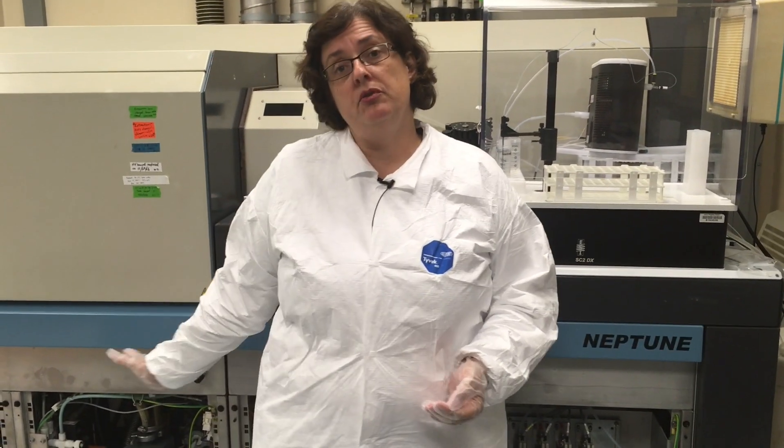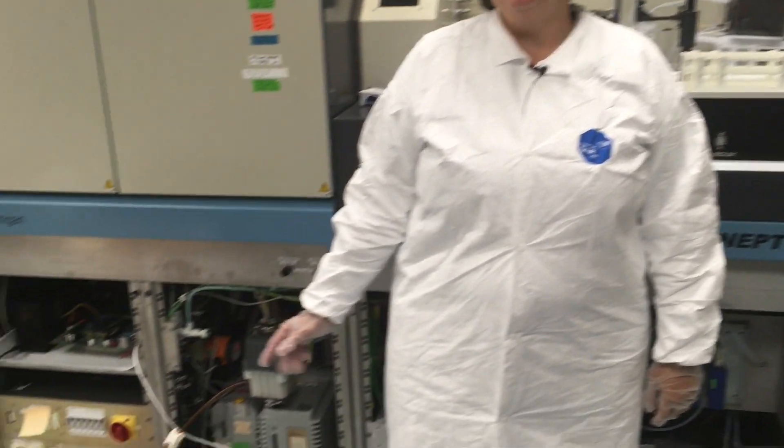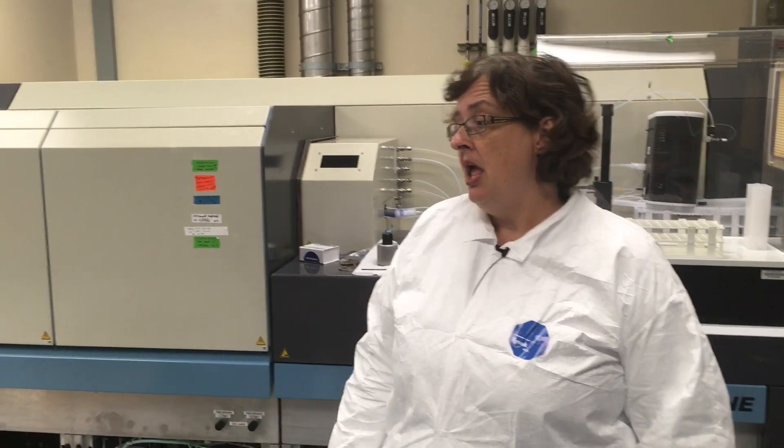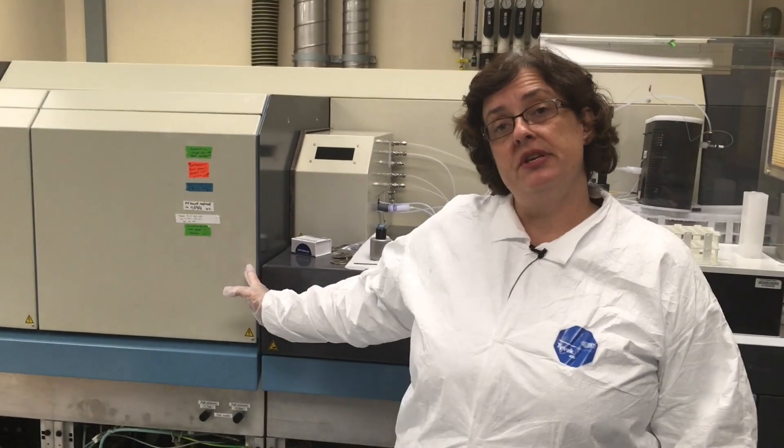I want to introduce you to the largest and most expensive instrument in our lab — a Thermo Neptune multi-collector inductively coupled plasma mass spectrometer. This one is old, but it's been well maintained. It is really optimized for measuring isotope ratios.